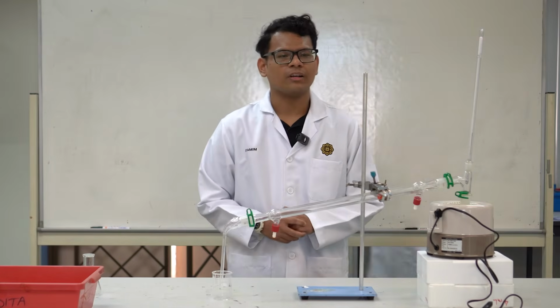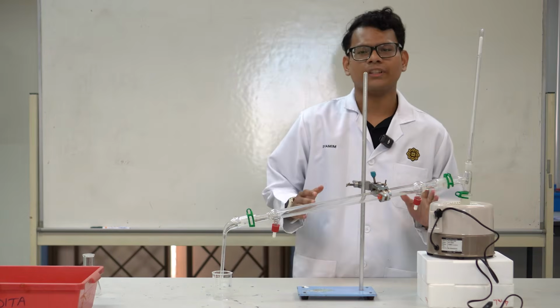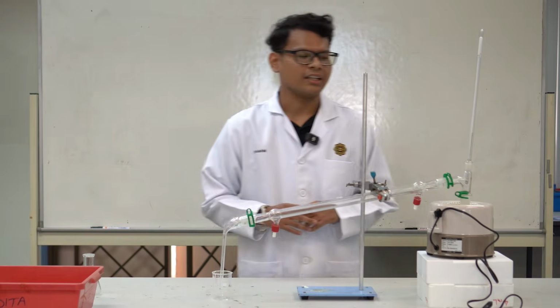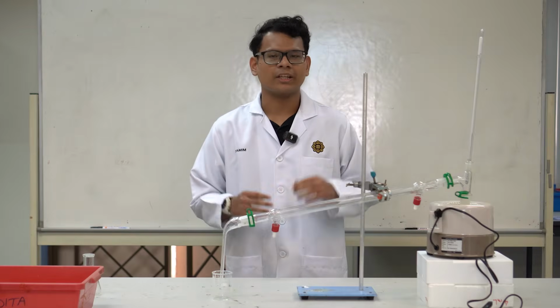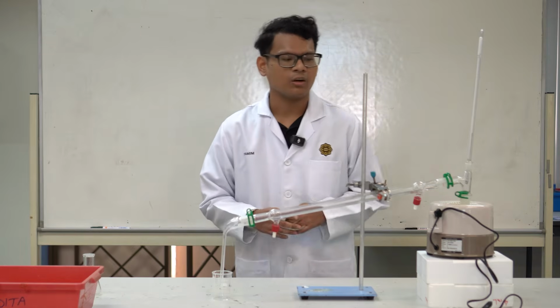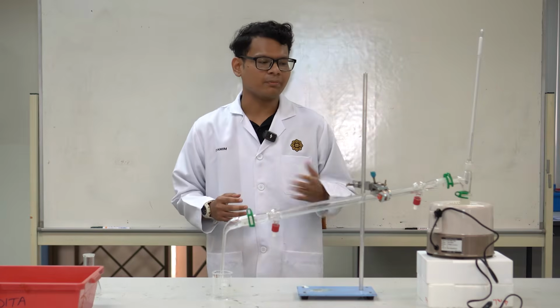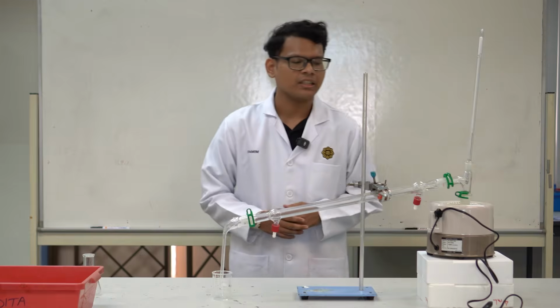As you all know, we are going to be discussing the distillation experiment. It is one of the separation techniques that we have learned in chemical engineering lab. Distillation, by definition, is a process to separate components in a mixture based on the differences in their boiling points. Although it is just a simple technique, it is very important in both academic research and industrial application.